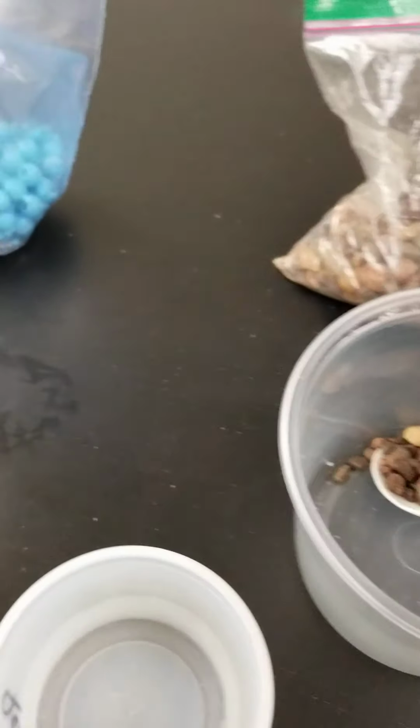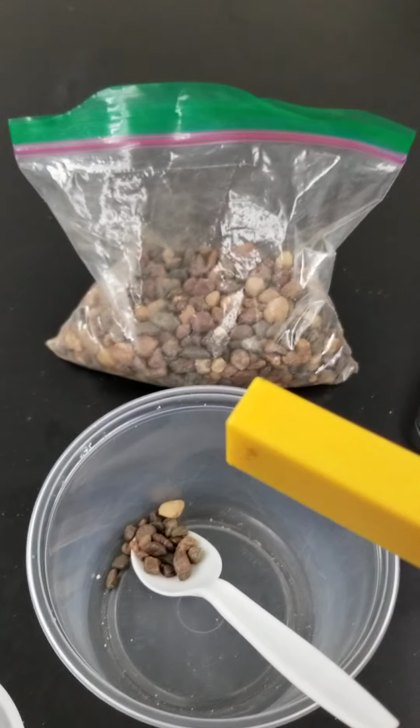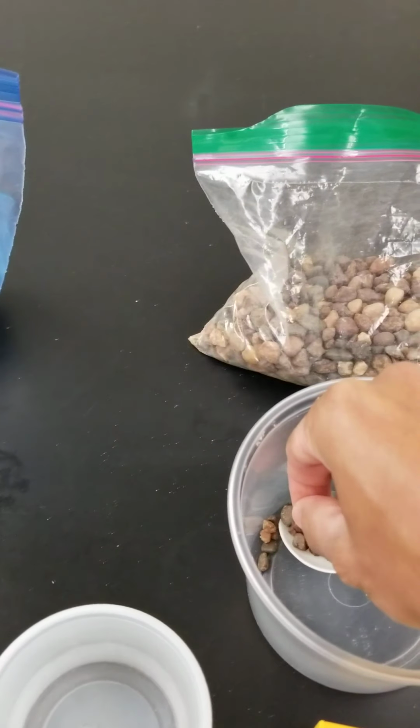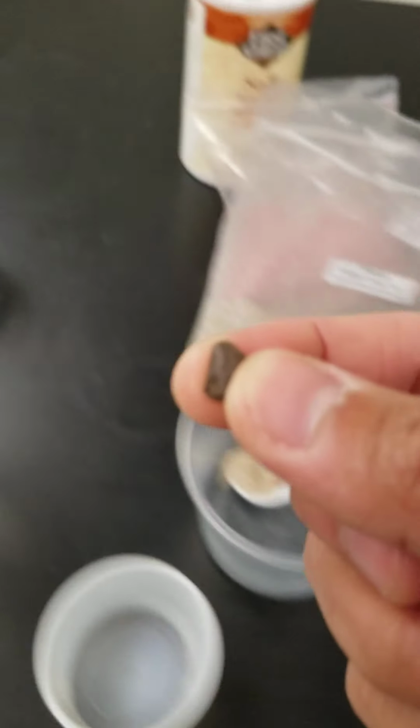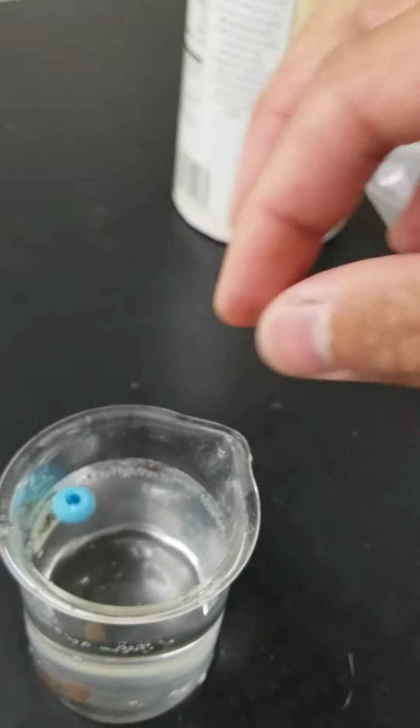And our last one are pebbles. So let me touch the pebbles that we have here. Nothing. Pick up one of them. And you can talk about all the other properties that need to be filled in on that table. Set it down there, and there you go.